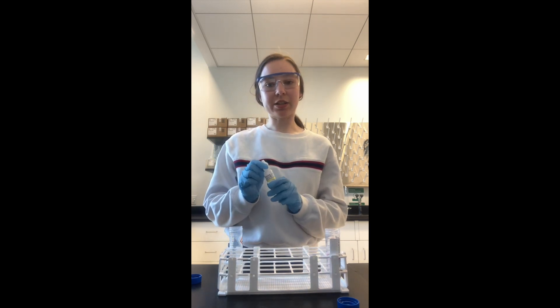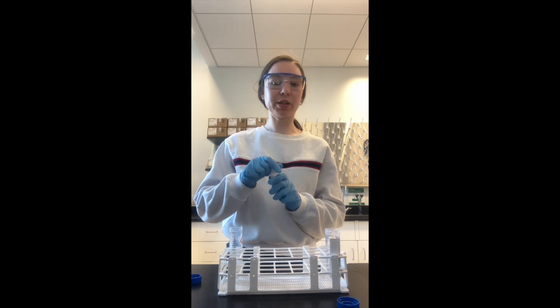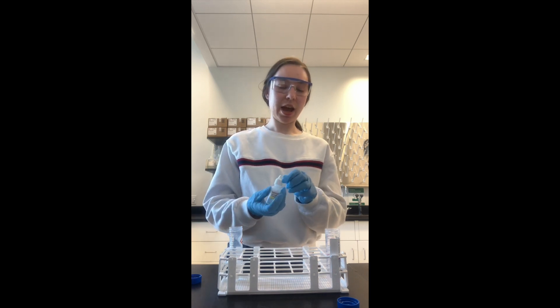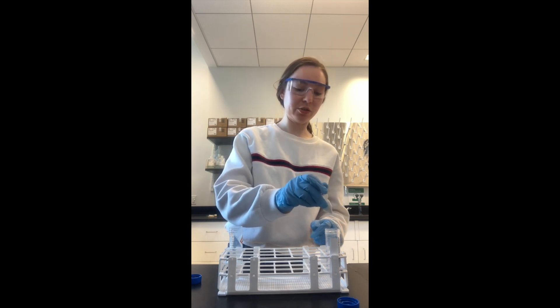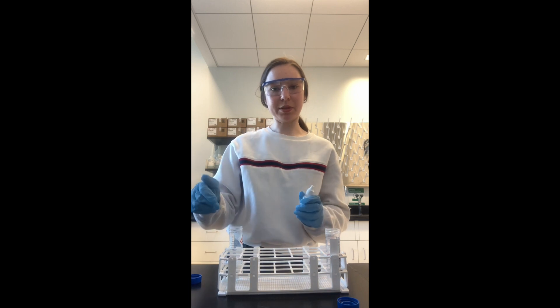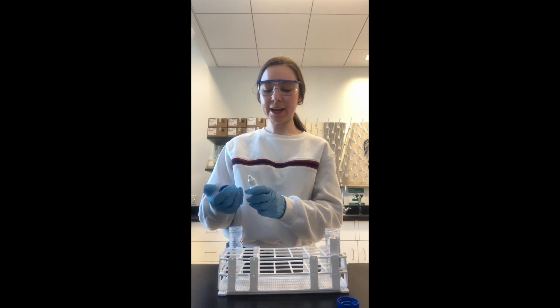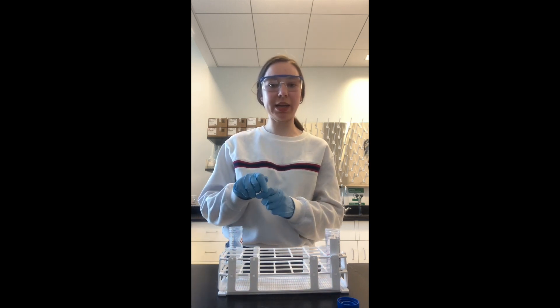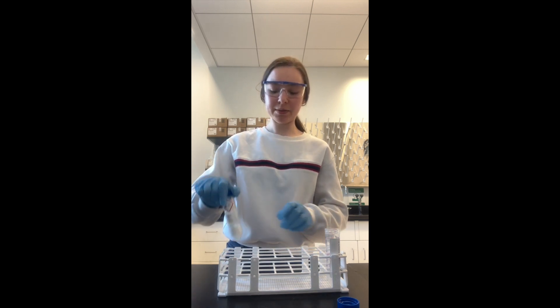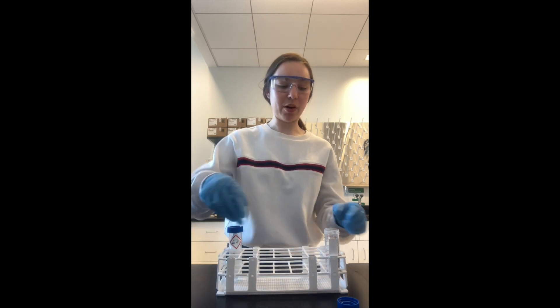For this demonstration I'm not actually going to dispense any acid, but if you were to, you would remove the cap, place it next to you, and carefully dispense two drops of acid into each sample, doing all the samples at once. Then you're going to immediately recap the acid, put it back in its secondary container, and close the cap. Then you can go ahead and cap all of your samples.